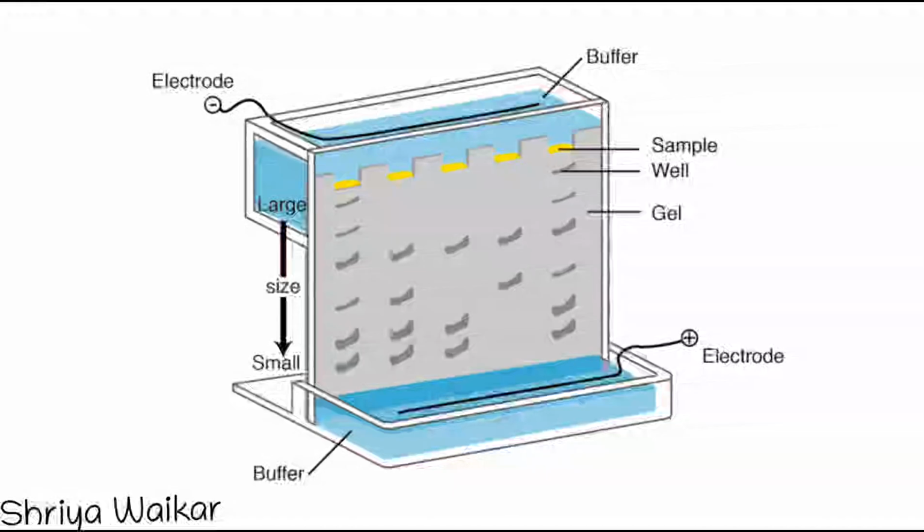Now, what is agarose gel electrophoresis? It is a gel, a matrix of agarose molecules held together by hydrogen bonds that form tiny pores. So the gel is used for DNA separation. Agarose is a polysaccharide, commonly available as a dry powdered flake.